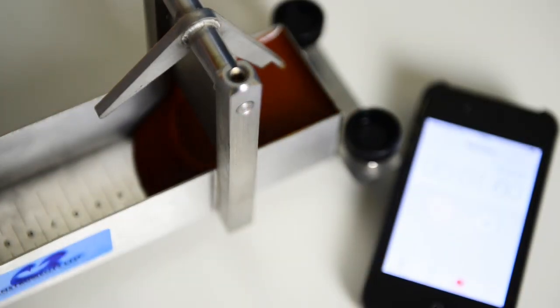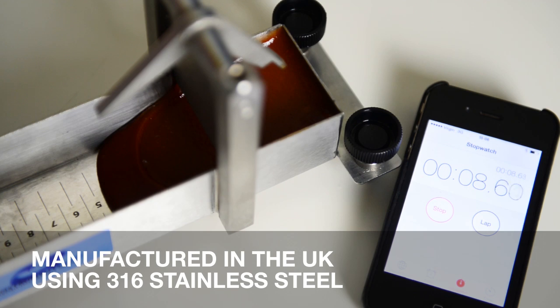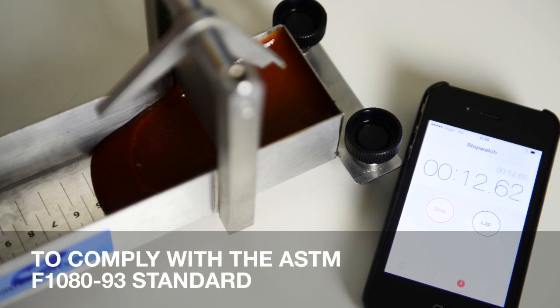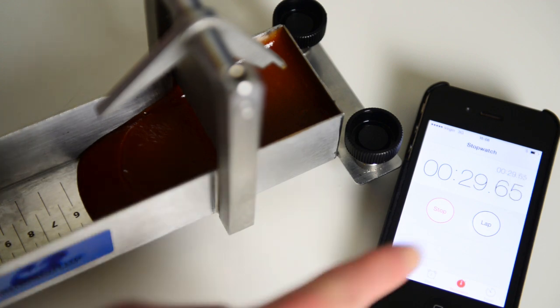Simultaneously start the stopwatch and release the gate. At 30 seconds I can now note where the sample has reached on the scale, both centre and edge.